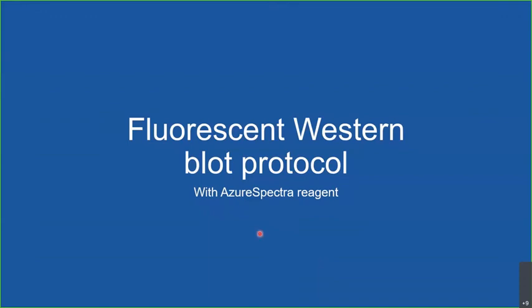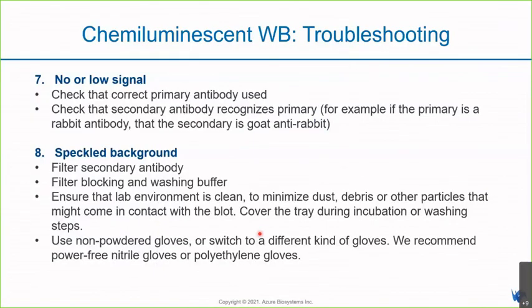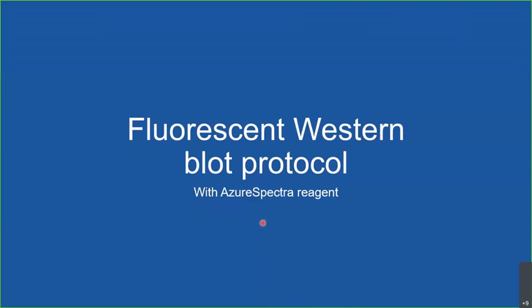Right, there goes our Chemiluminescence Westerns. Next is the Fluorescence Western blot protocol.